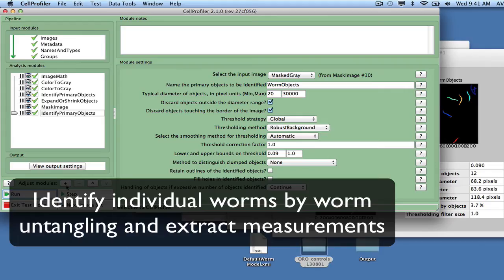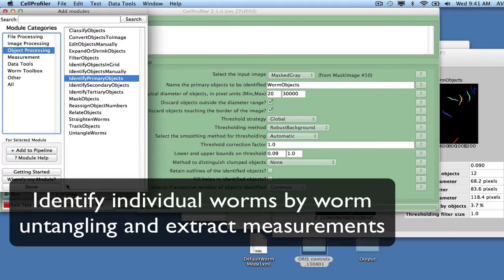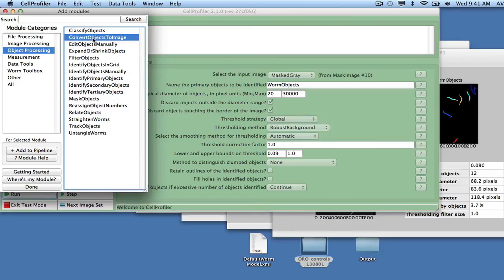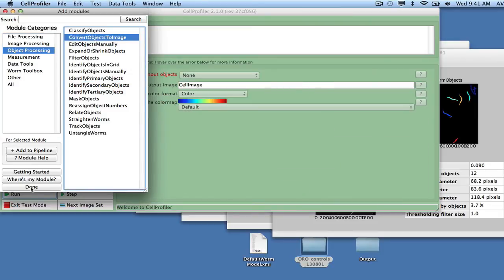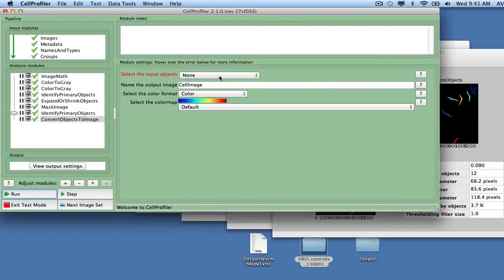Add the Convert Objects to Image module to convert the worm objects to a binary image, calling the output image WormBinary.